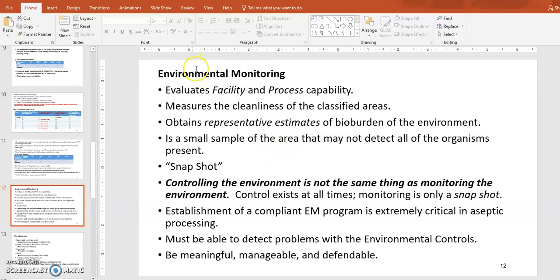So the manufacturing environment should be very clean. How do you make sure it's clean? You have to do the testing all the time. So the testing activity is actually environmental monitoring. By doing environmental monitoring, you can evaluate the cleanness of your space or process or personnel who are working in there. You are capturing the samples and then testing, quantifying the amount of contaminants in that sample. That's the environmental monitoring.